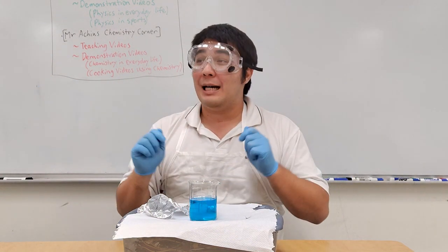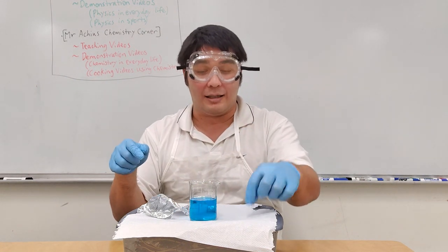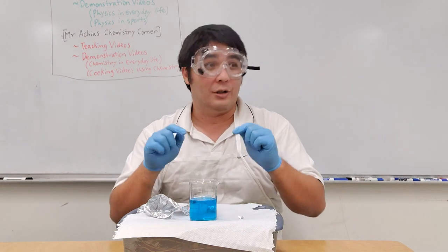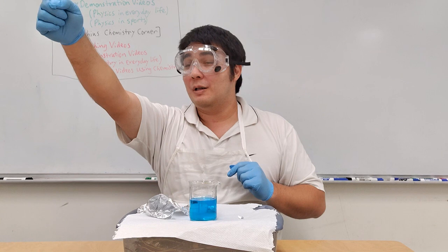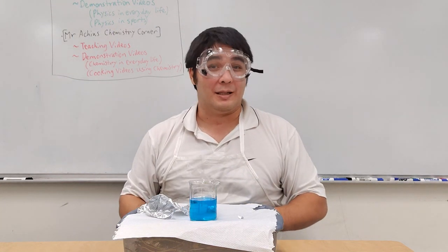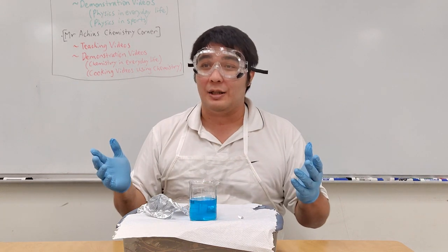What do you guys think? What kind of chemical reaction, what type of chemical reaction is this when I add aluminum to copper chloride? Say that louder. Very good. It is single replacement. All right. Now let's go to the next part of the class discussion on this.